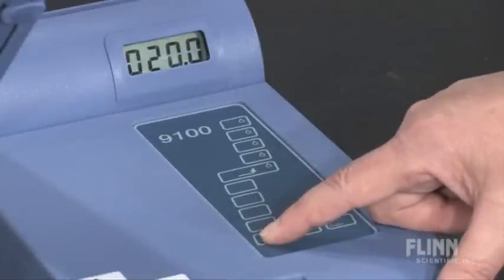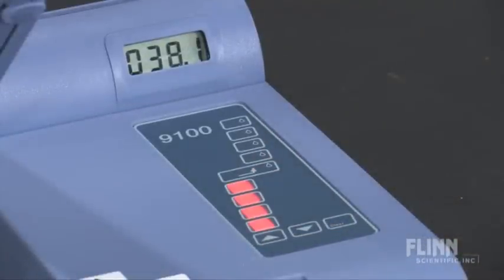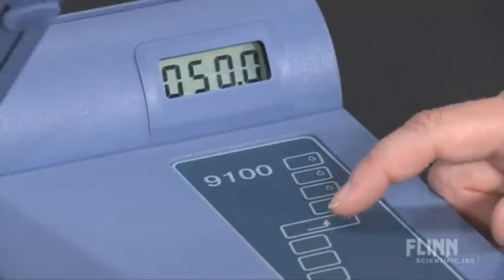Set the initial temperature and specify the heating rate. The unit heats up or cools down within five minutes, and the oven temperature automatically reverts to test consecutive samples under the same conditions. Simple push-button operation guarantees accuracy.